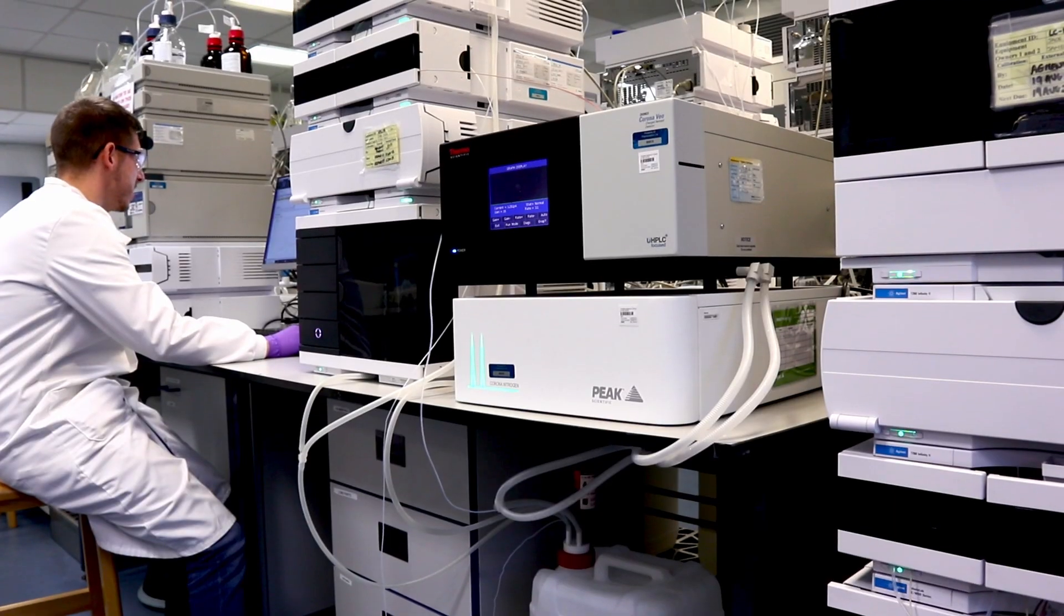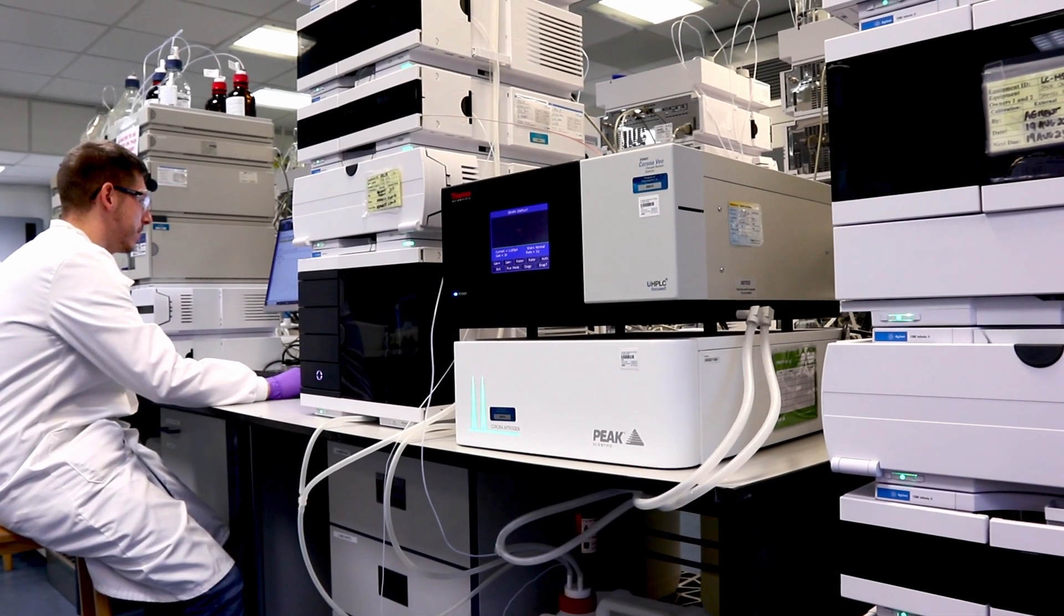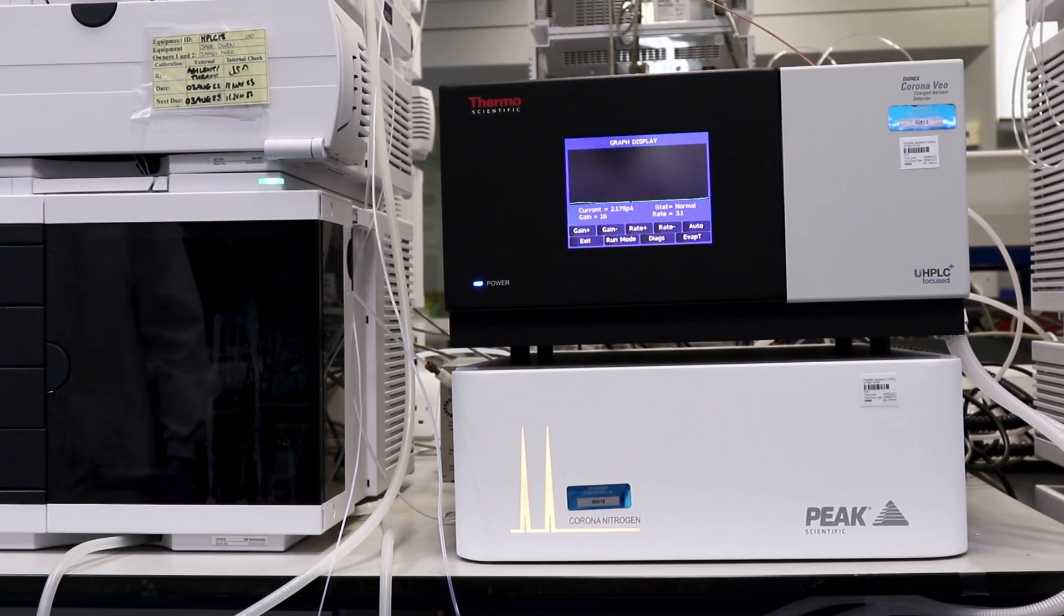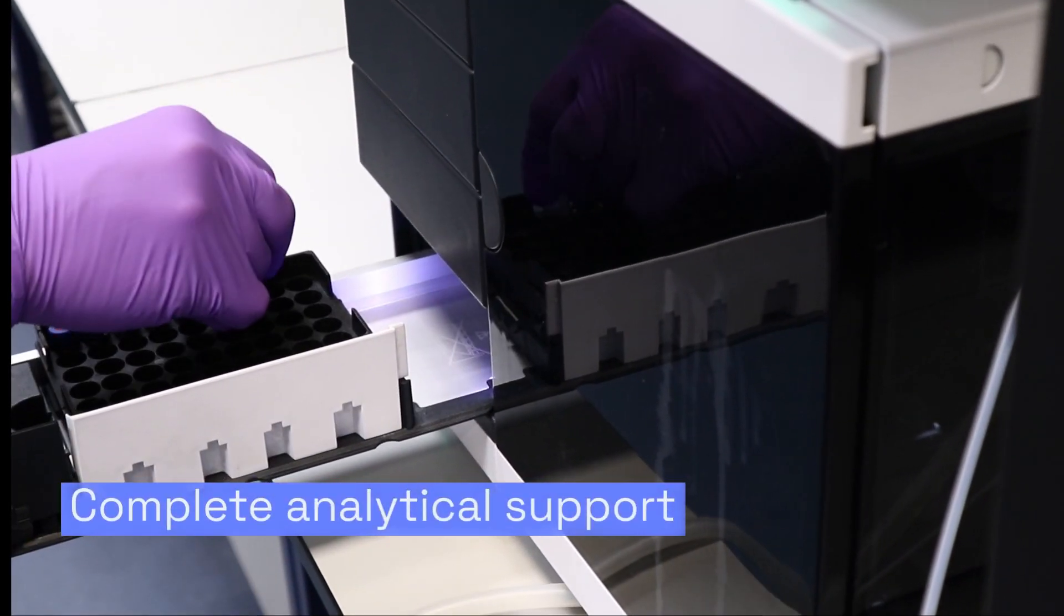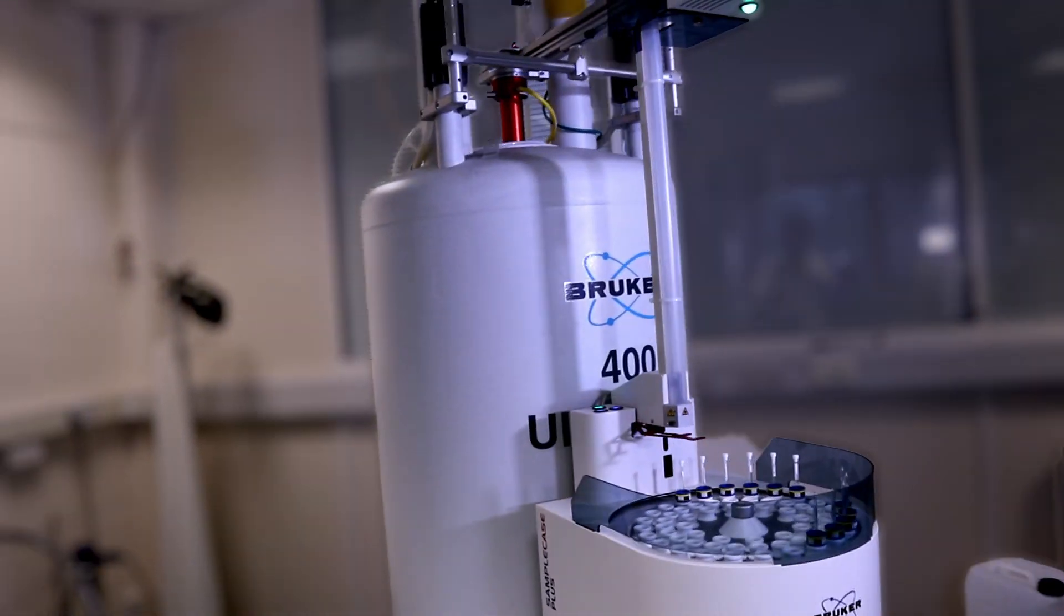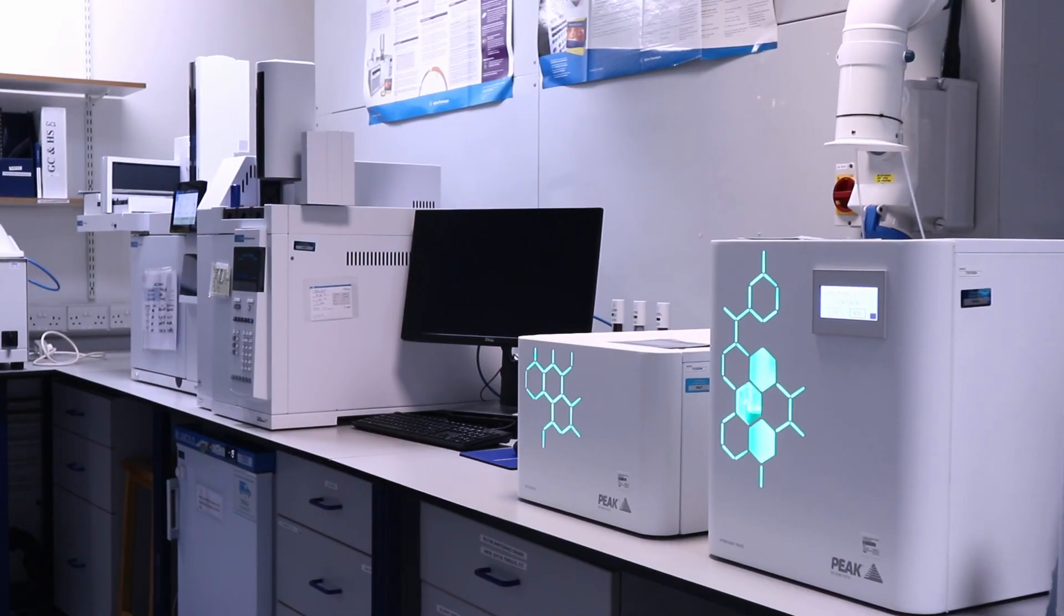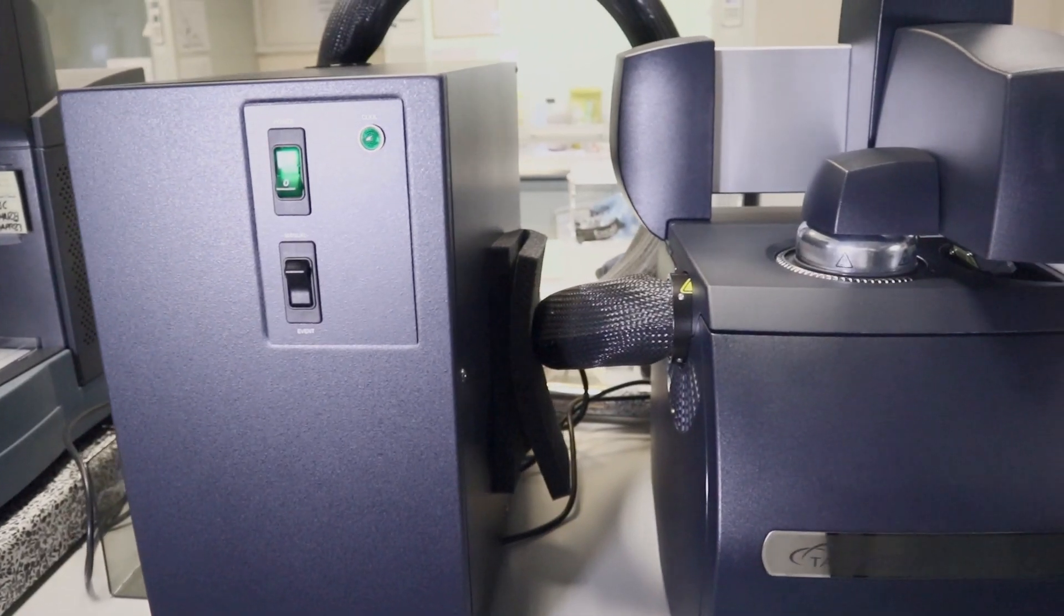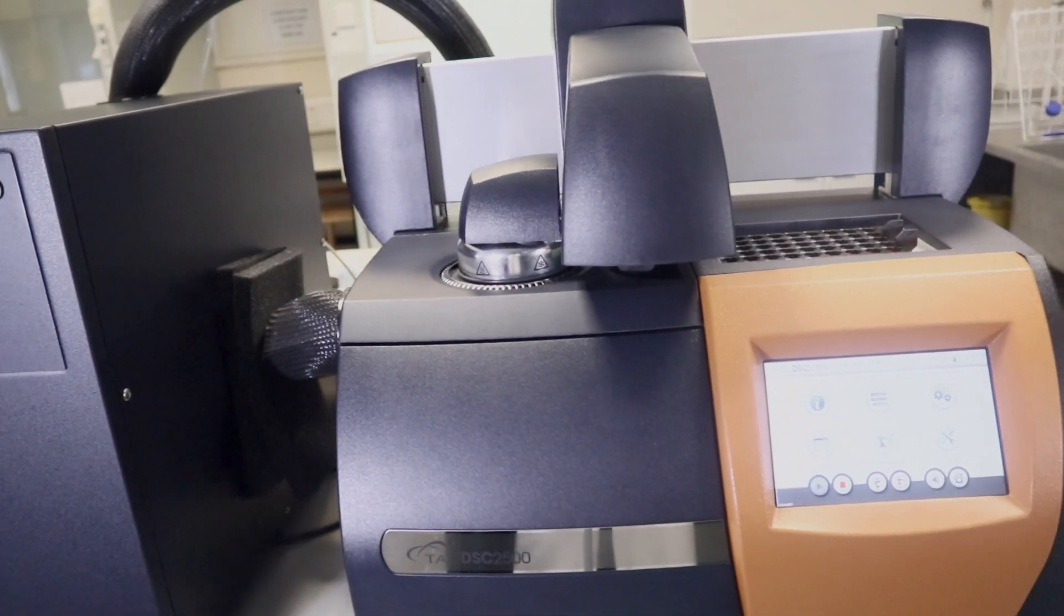To ensure impurity control and tracking, our analytical team can develop or transfer HPLC and UPLC methods. We have standard UV detectors as well as ELSD and CAD for non-UV active molecules. A complete analytical suite with NMR, GC, LCMS, and solid state services is also available on-site in Cambridge.